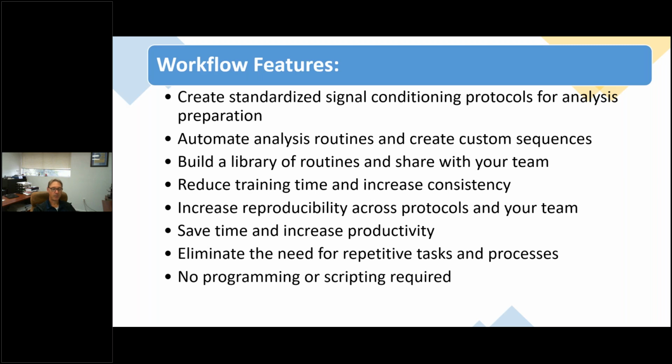Yeah, and of course you eliminate a lot of those frustrating tasks. Like if you've got 20 participant files and you just need to go in there and rename one of the files or duplicate it and rename it, that's a lot of files that you've got to open and touch. This will allow you to do that over all 20, and it will do it very, very efficiently. And of course, the big advantage over the scripting is that there's no programming. This is a graphical user interface. It's drag and drop, and makes it much, much easier.